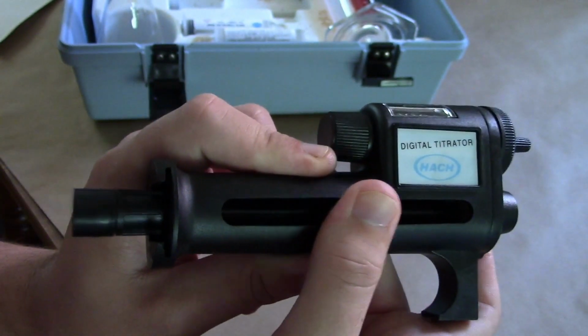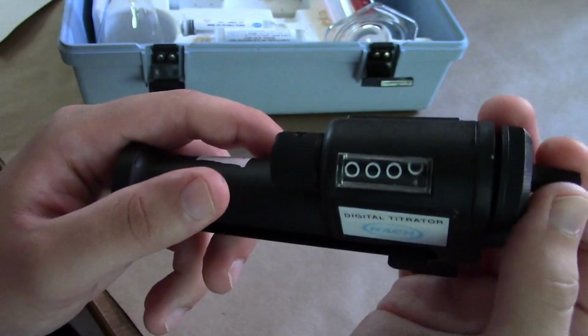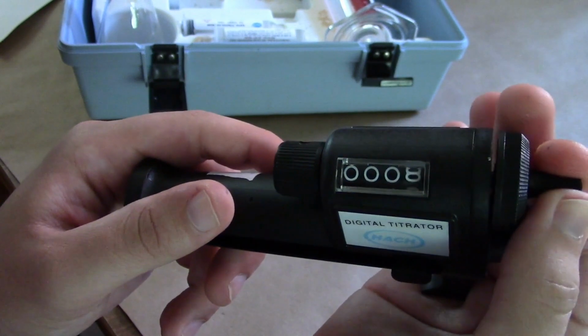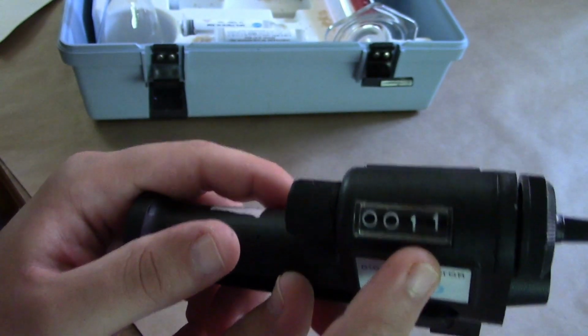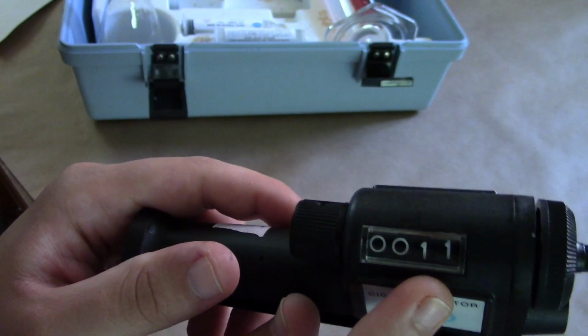So I'm going to put that back, and then this is actually going to dispense the acid in very, very tiny drops, and then this number, which you can read right here, will tell us the milligrams per liter of calcium carbonate alkalinity.